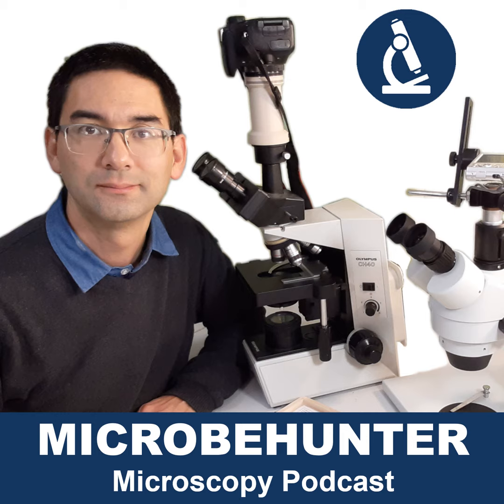And if you're new to the hobby, then you don't really have any specific expectations, I guess. If you ask me what I want to observe as an amateur, pretty much anything that's interesting, right? Pollen samples, maybe, some dust, some pollen from plant flowers. I have no idea. And that's kind of confusing, because as an amateur I don't have a specific area of interest. I have a very broad interest, and I want to look at everything and put everything under the microscope. But when you want to buy a microscope, they ask you a specific question. What do you want to look at?